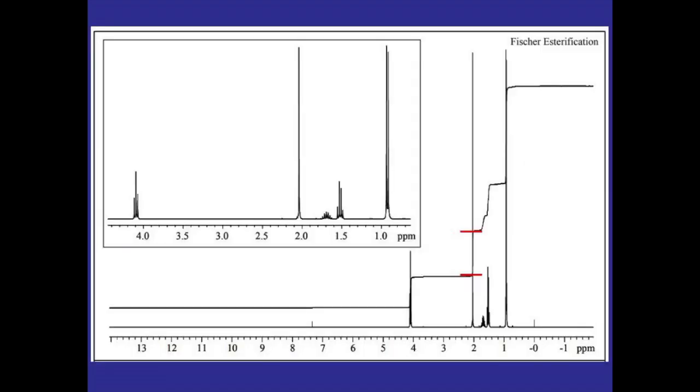If we look at that singlet and consider its integration, we can see that the integration is larger than that of the peaks around it. So this has to be the one with the integration of three, meaning that this NMR goes to the product, the isopentyl acetate.